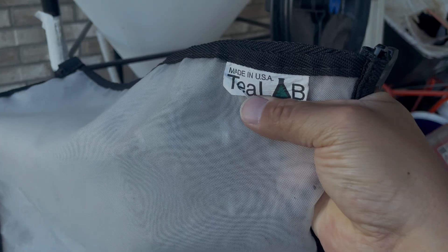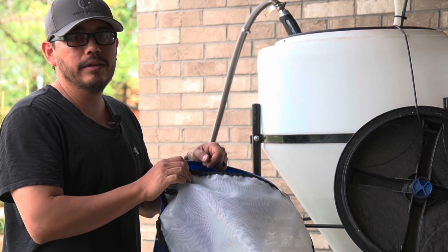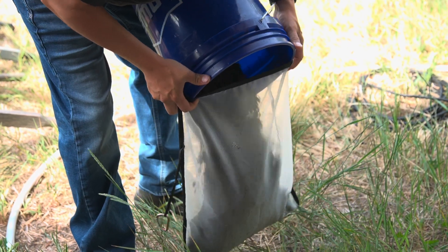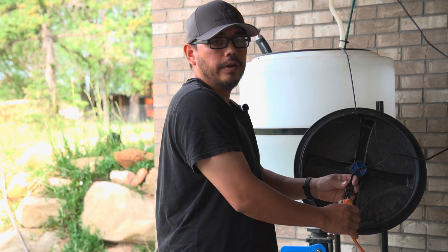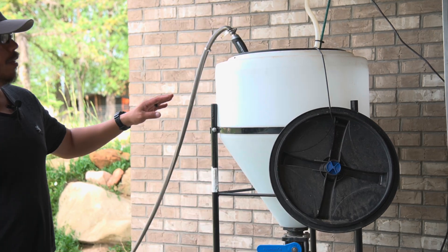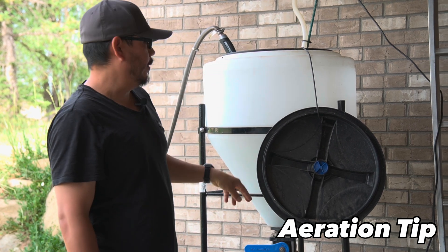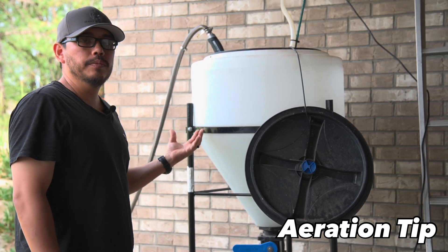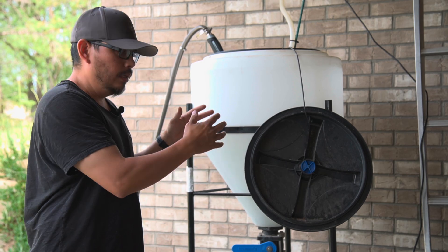Now we're going to add our compost to our 400-micron bag. You don't want anything finer than 400 microns because your nematodes will not make it through the bag. It's important to use this screen material so all organisms, including nematodes, can release into the liquid. While it's filling, we add the air — the pump runs on half-inch tubing that goes down to the very bottom of the tank to create a rolling boil for maximum oxygenation and agitation, getting all those microbes off the material and into the water.